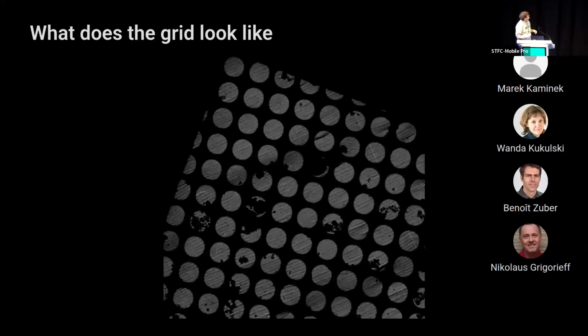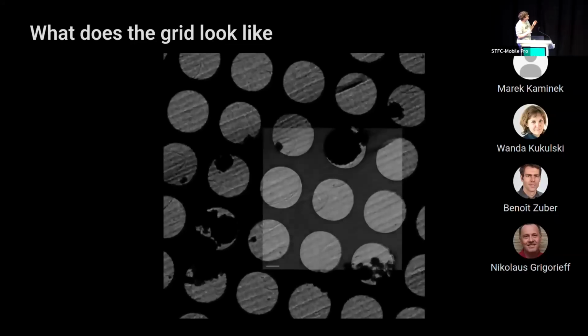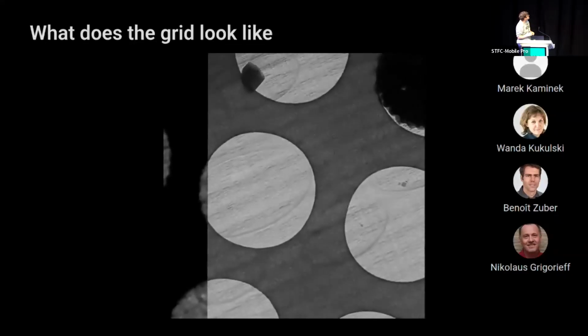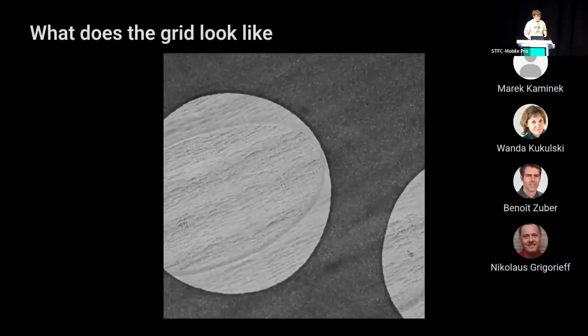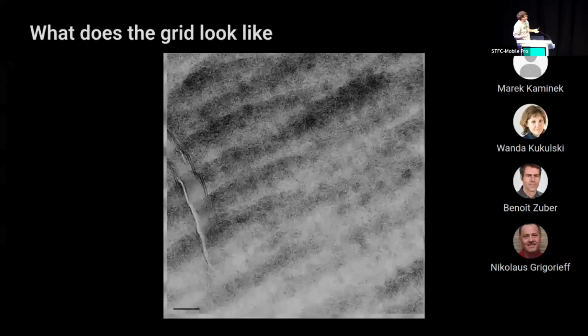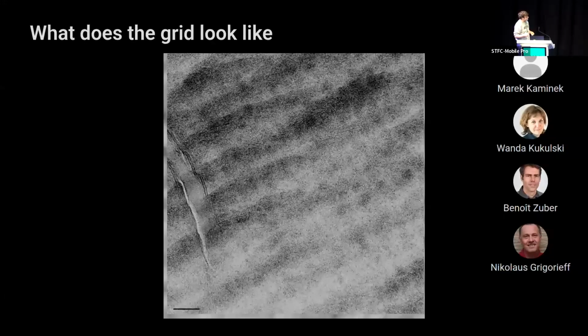If we zoom in even further, we can start to make out the slices of yeast cells that are in that ribbon. And you can also now see these cutting artifacts that are in these samples. And then zooming in even more, we can take high resolution micrographs of these samples at pixel sizes where we can really do the high resolution cryo-EM that we all want to do.